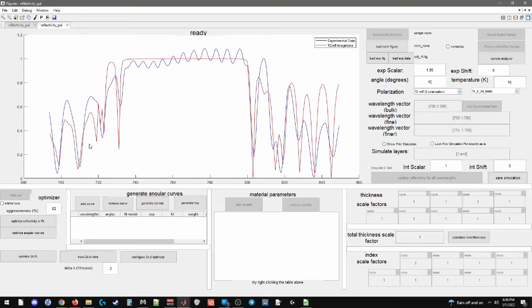This isn't ever going to look perfect because there's a lot going on. When you have hundreds and hundreds of layers growing on top of each other, you've got all sorts of strain effects and just impurities sometimes. Even though these samples that Dr. Pfeiffer or Dr. Wasilewski grow are very pure, it still is an issue. Yeah, so this looks pretty good.